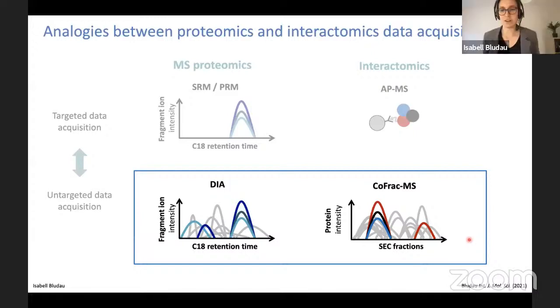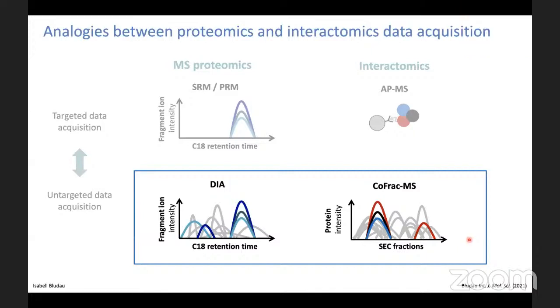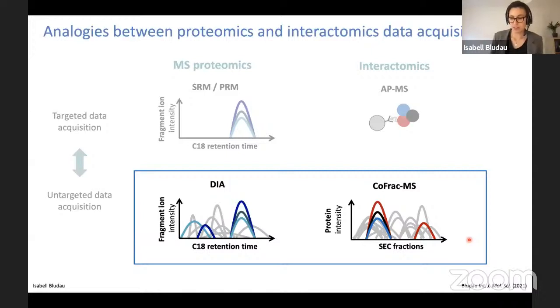Yeah, that is a very good question. So our experience is that this actually doesn't happen too often. Mainly, we look at the overall protein content after the fractionation. We check the protein content in each of the fractions, and we should see that there is still a lot of protein in the early fractions that are in the high molecular weight range.